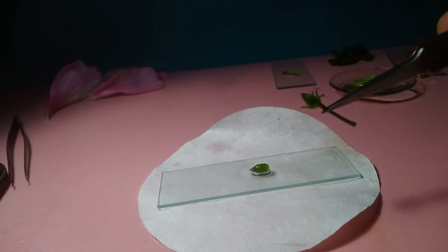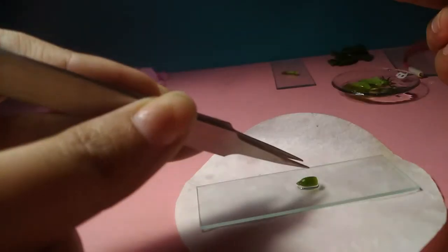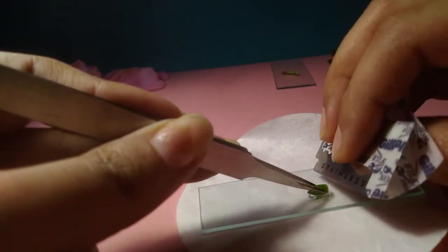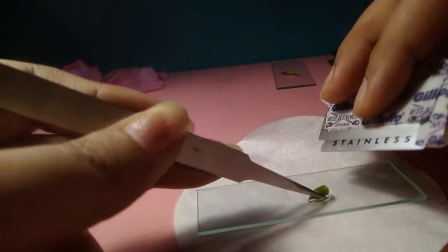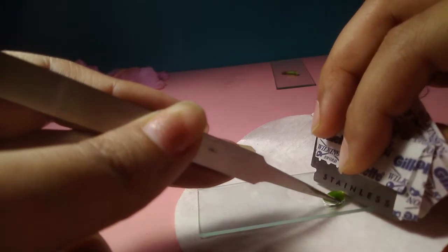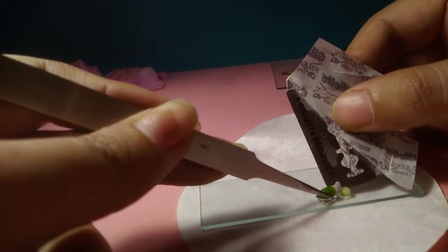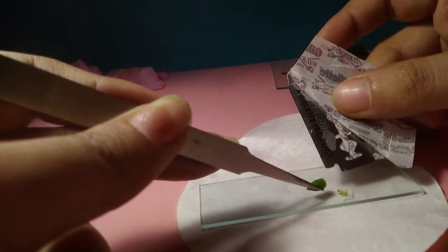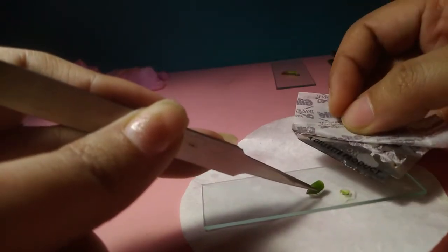Now, if you are going to sit for a practical exam and you need to preserve your pistil intact, but also you need to produce a TS, a transverse section or a longitudinal section of your ovary, then you can simply use a flower bud. Just hold it like this, and at the bottom of your flower bud, just put a cut mark. Very fine cut, as fine as possible. Now this fine cut is actually the TS of your ovary, transverse section.